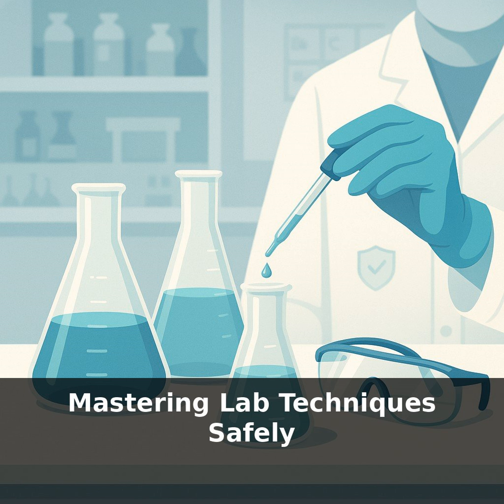Welcome to Chapter 1 of our series, Mastering Lab Techniques Safely. In this episode, titled Introduction to Lab Safety and Equipment, we'll explore the common hazards you might encounter in the lab and how to navigate them safely. So, let's dive in.